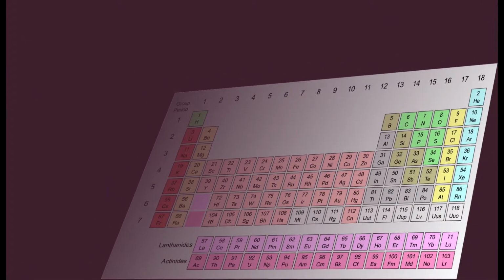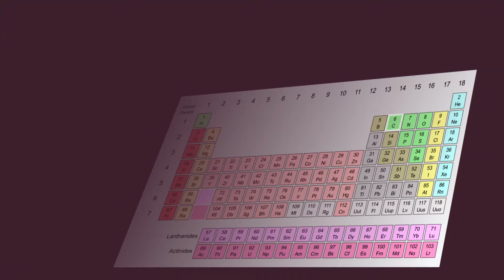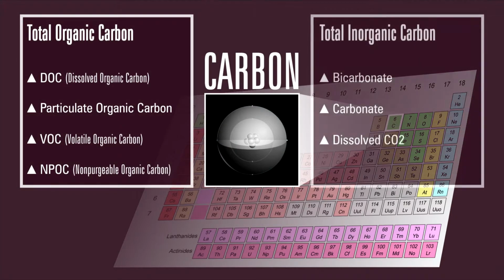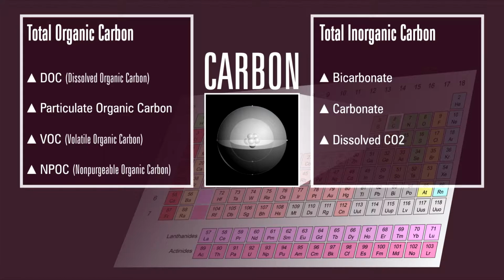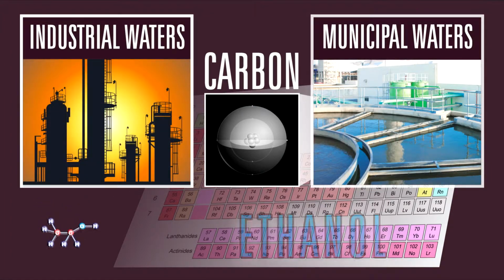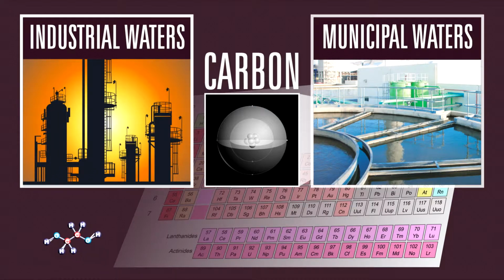The element carbon forms millions of compounds, more by far than any other element. Most compounds, and all organic compounds, contain carbon, and the study of carbon is foundational to organic chemistry. Since all living things contain carbon, it's an important indicator of contaminants that can compromise water quality.